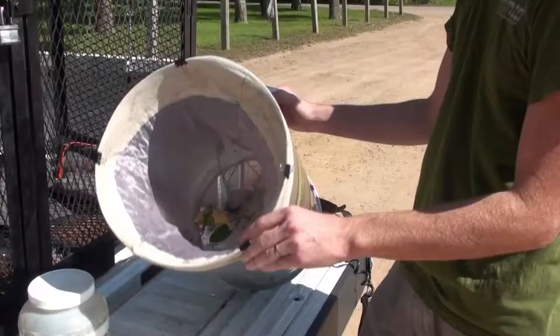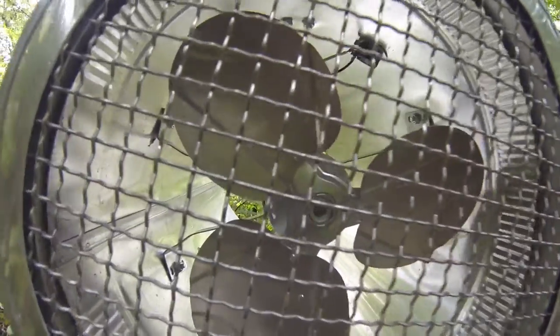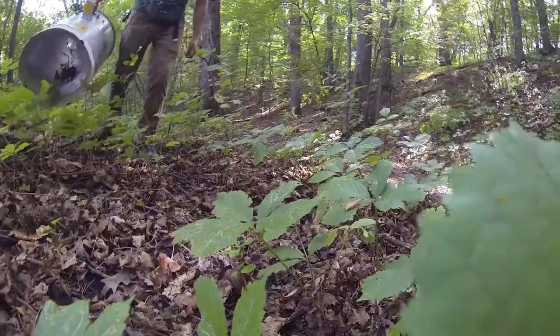The Succ-O-Matic works by drawing a strong current of air through a net affixed to the front end of an aluminum cylinder. A 12-volt motor turns a fan that creates the air current, sucking air in through the front and blowing it out the back end. Insects, leaves, and other light items are pulled into the net by the air current.